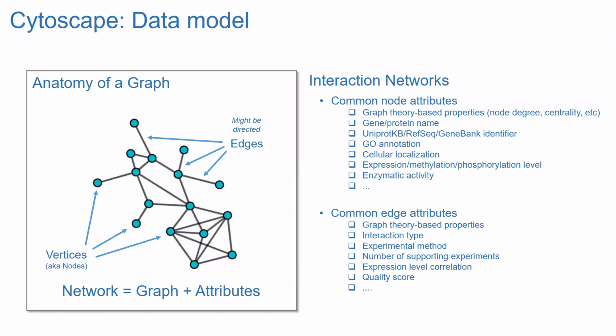So that's what can be put there. And all that Cytoscape does is just let you collect all this data, and then make the graphs corresponding to your data look more or less pretty, or at least informative. So that's how it goes.